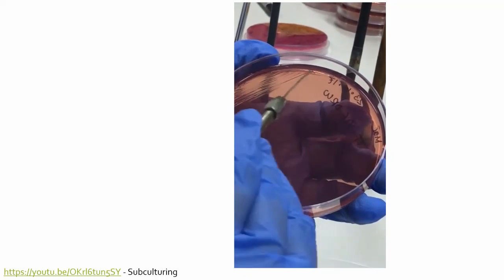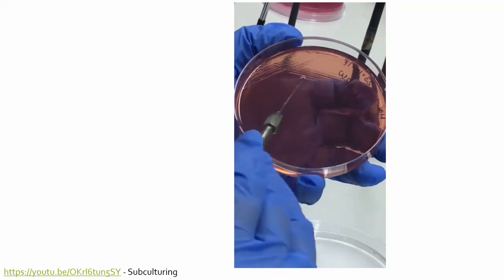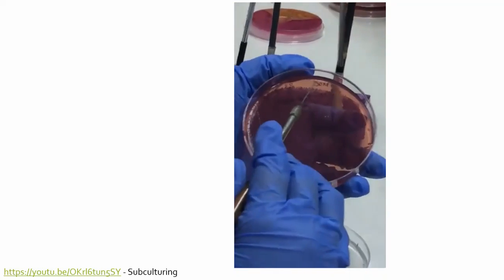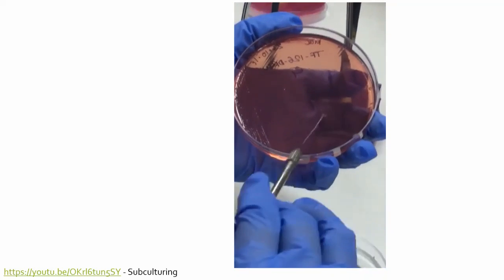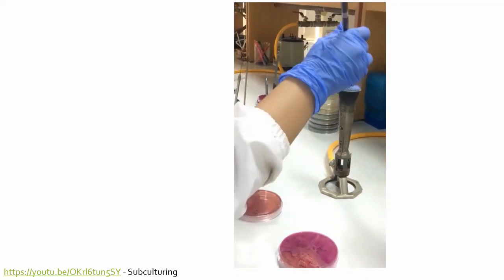So many times they are making streaking. It comes with practice every time. He's crossing the line even. Then after it is reduced. Okay. It's going to happen. Yeah, no problem.